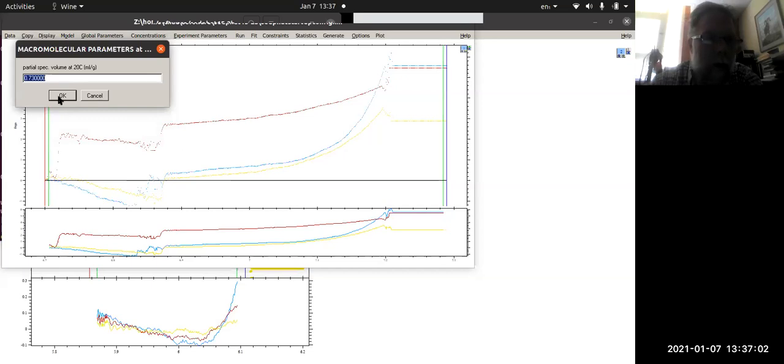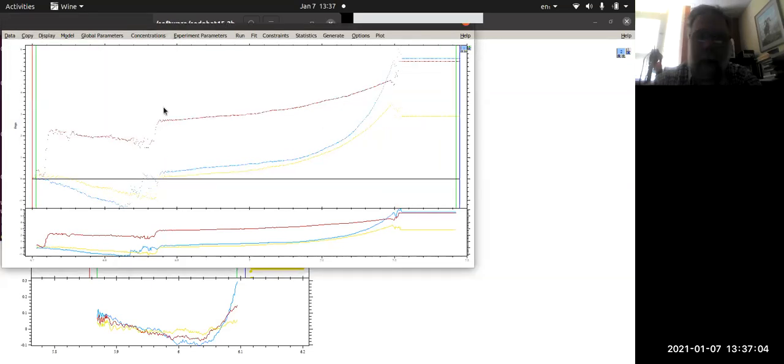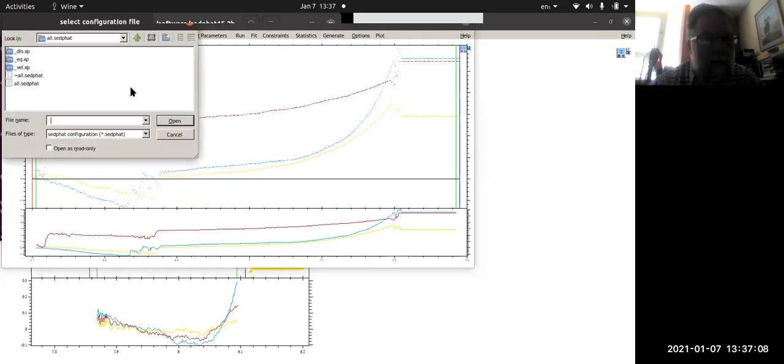Yeah, it looks okay. But I never really saved it right with the right species. So I'm just gonna mess around a little bit and see if I can find some other pieces of data that look interesting. Very unlikely that I will because I kind of went through some of the more interesting stuff.